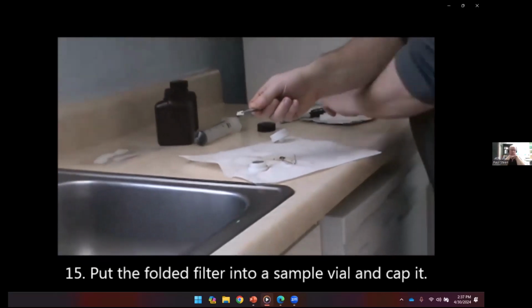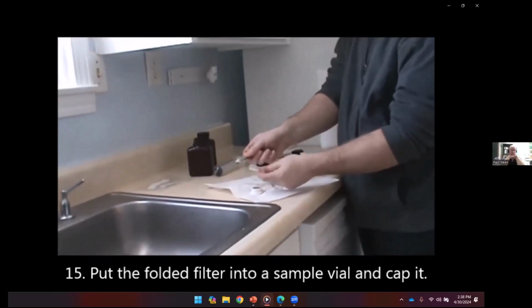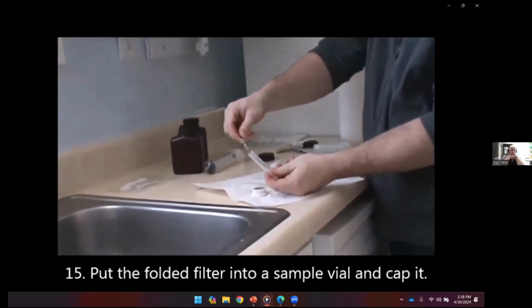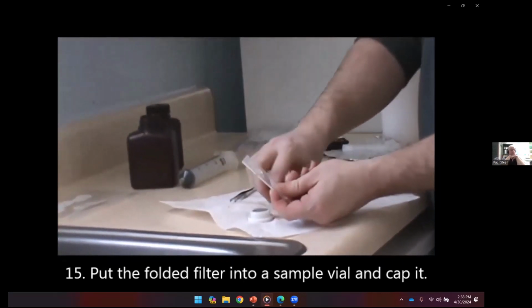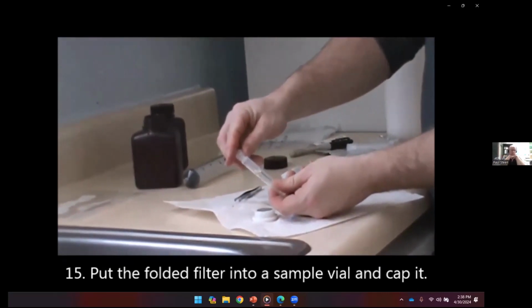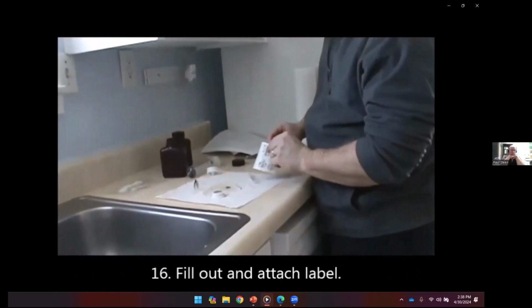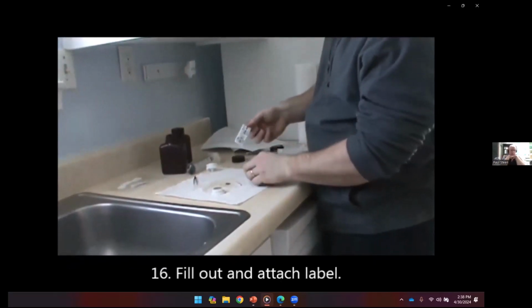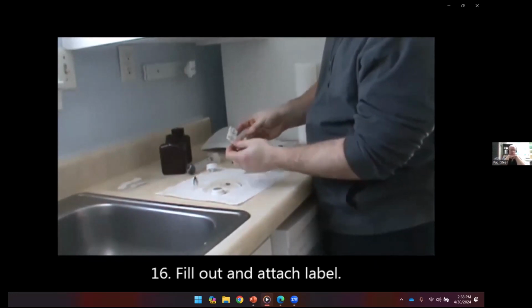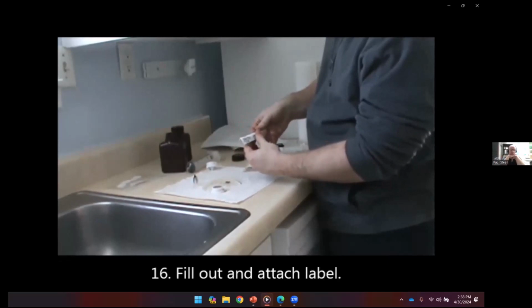Put the folded filter into a sample vial and cap it. Place a filled-out sample label onto the vial lengthwise so that none of the label is wrapped upon itself. Let's take a look at what a correctly filled-out sample label looks like.